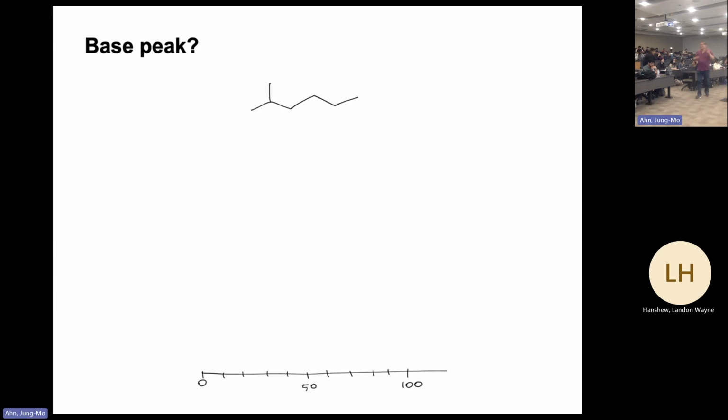Let's work out the mass spectrum of this particular molecule. What types of signal will you get? Obviously, you will see the molecular ion peak, which is just a radical cation of this molecule. That is the first thing you will get. The neutral species will not be seen by the mass spectrometer, so it's got to be a cation or a radical cation.